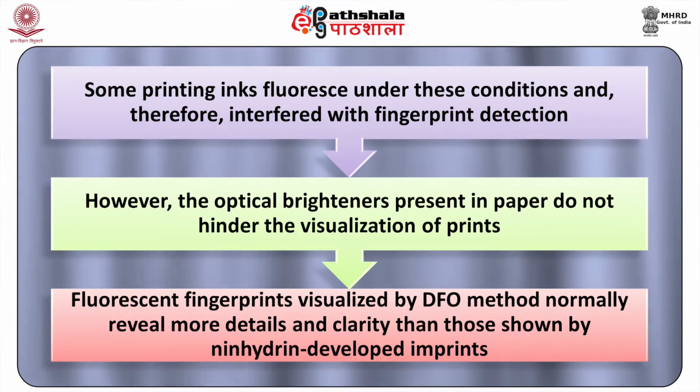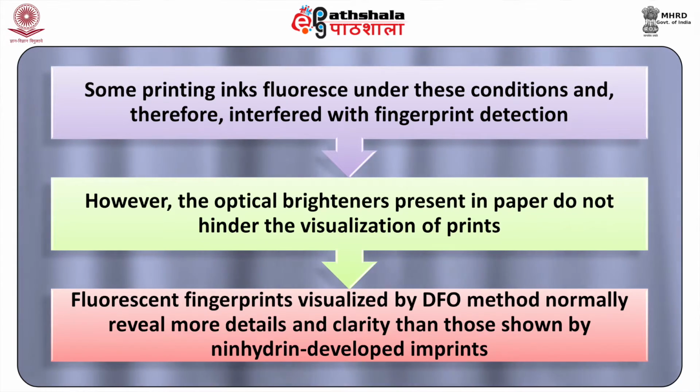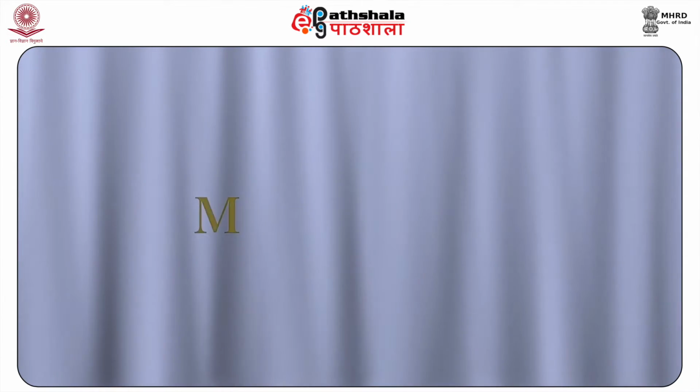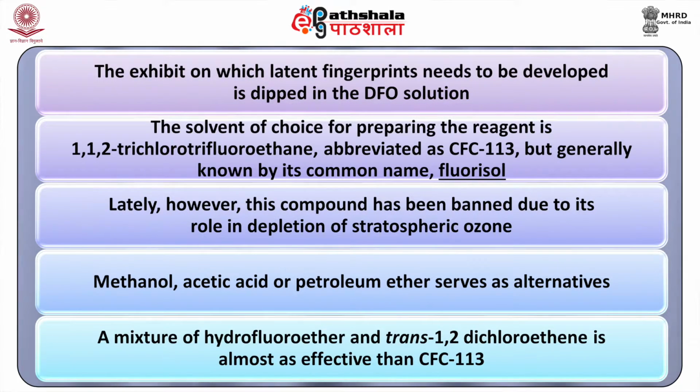Fluorescent fingerprints visualized by the DFO method normally reveal more details and clarity than those shown by Ninhydrin developed imprints. Now let us see the methodology. The exhibit on which latent fingerprints need to be developed is dipped in the DFO solution.